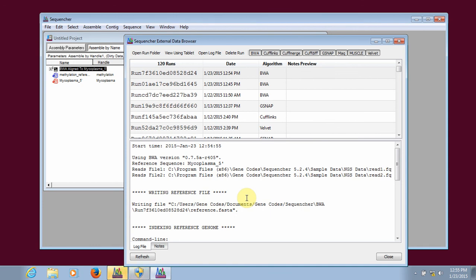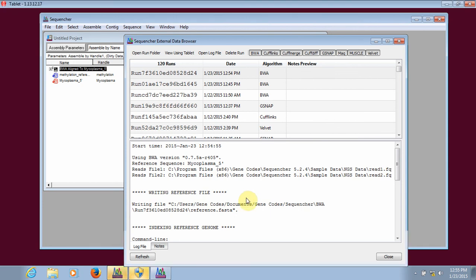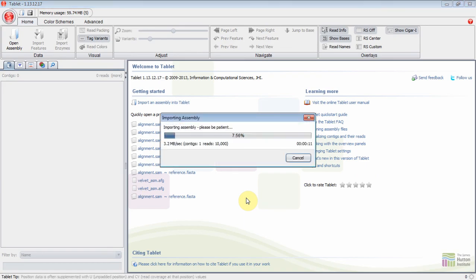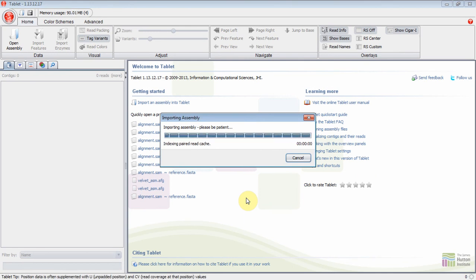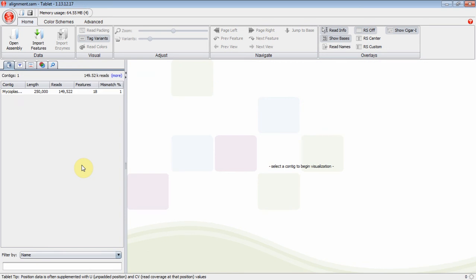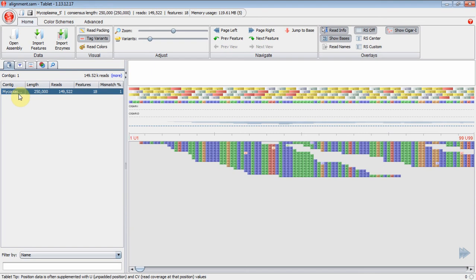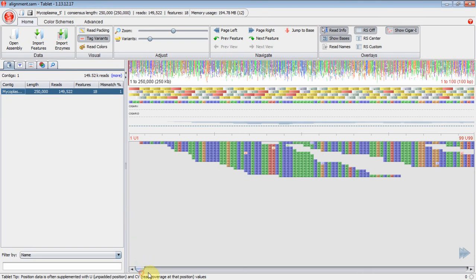Now the alignment is done, and Tablet is opening up so that we can view the results of our alignment. And here's our alignment in Tablet.